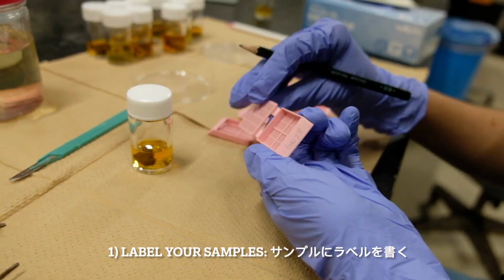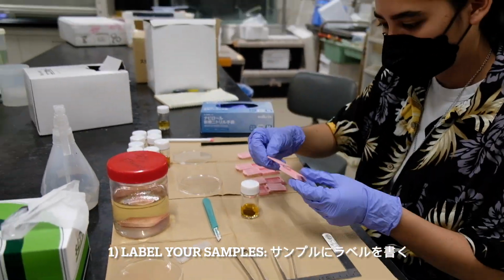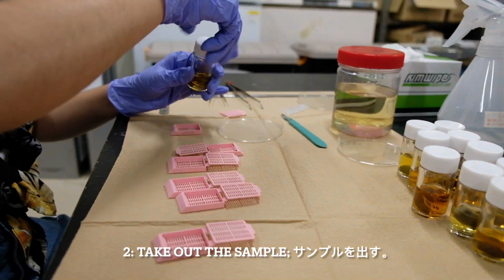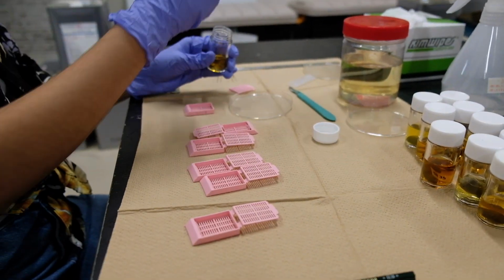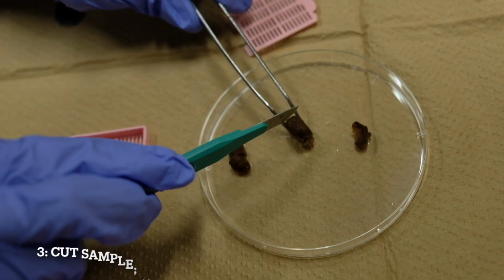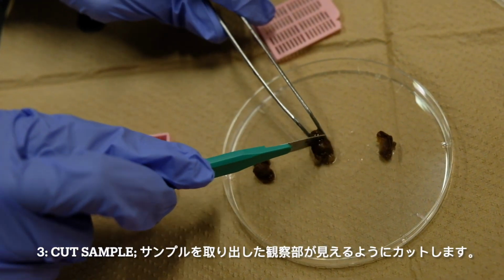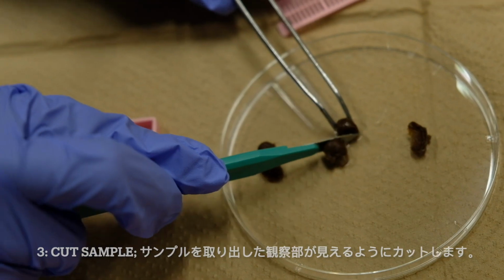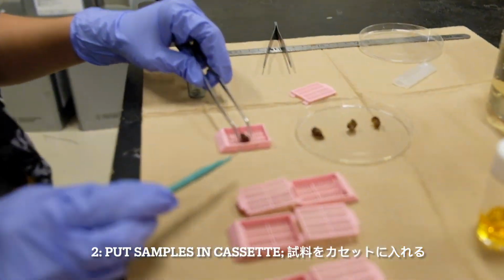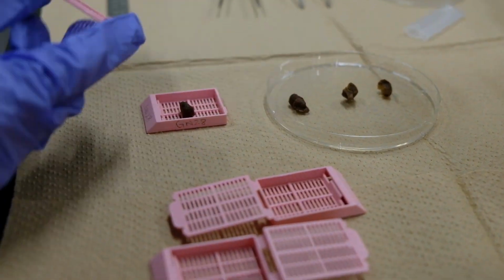The purpose of this step is to select the proper areas for examination. For reproductive studies of soft corals, the target area are the gonads, so we have to make sure that we capture the proper tissue orientation. So after we've taken out the sample, we have to correctly cut it so that it is in that proper orientation, and then we can take that sample and put it in the cassette.